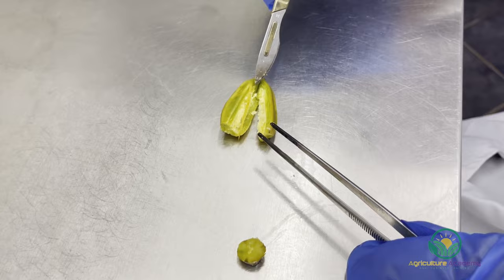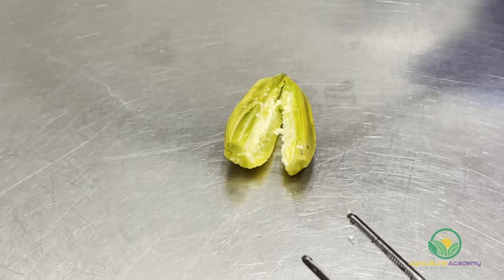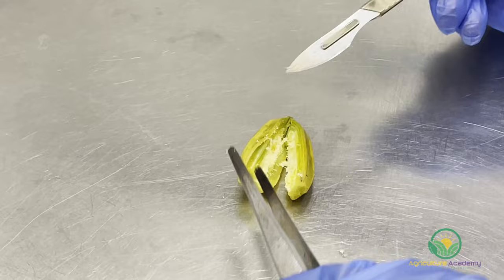You can see here all the fluffy, white seeds on the inside of the pod. Because we cut this pod open in a sterile environment, all these seeds should be sterile too.